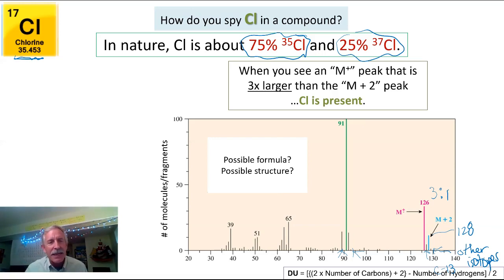And coming up at the end of this presentation, we will look at how you will not only have mass spec data to help you figure out this mystery, you will have IRs, you will have carbon NMR, and you will even have some acid-base chemistry on this unknown. So tons more data is going to be given to you to help you figure out the structure of this organic molecule, which could be an unknown drug, could be the cure for cancer, could be who knows what in our orgo world, the structure of the coronavirus. These are all things that could be deduced using instrumentation and are true mysteries to us.